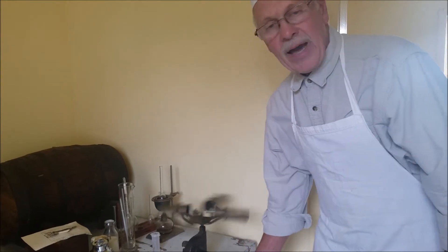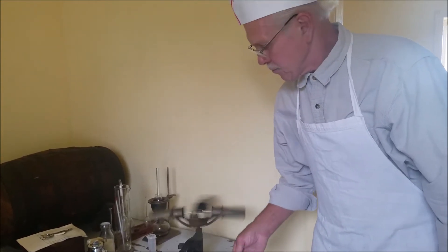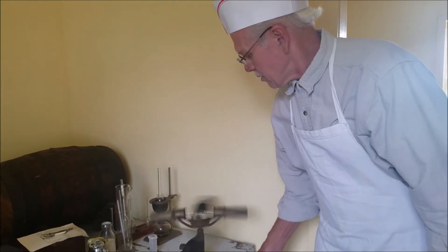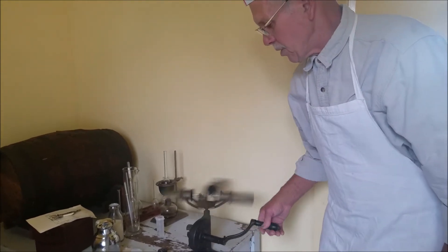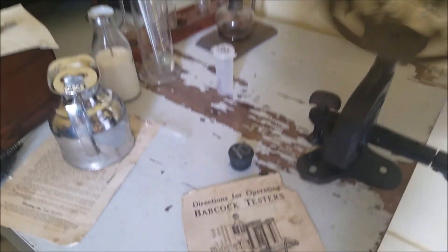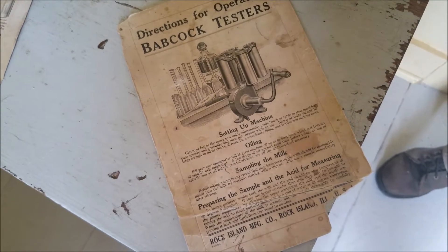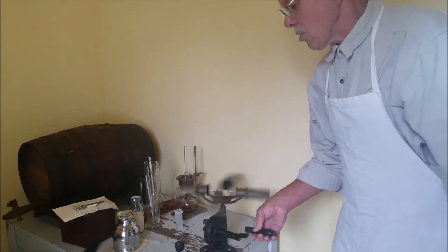By 1890, Mr. Babcock came up with this test. He didn't have a patent on it — he didn't want to patent it so everybody could use it. A lot of tests were made prior to 1890, back in the 1870s, but they were never accurate. Very elaborate machinery, and it was never accurate. But this is accurate. They're still using this test today, and new machinery still has to go back to this test to make sure everything is standardized.